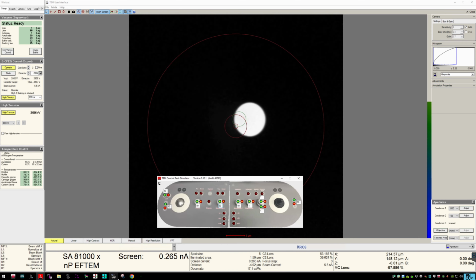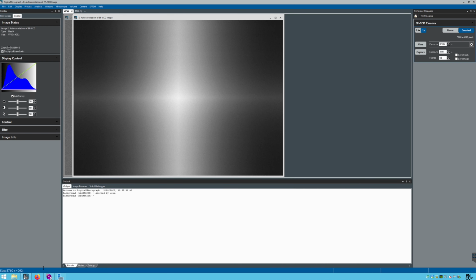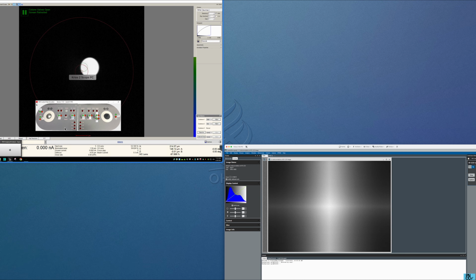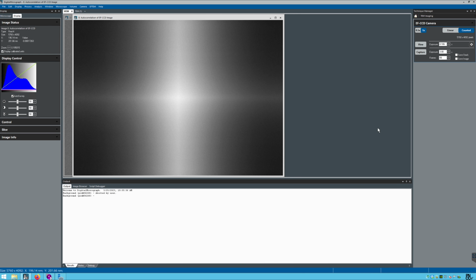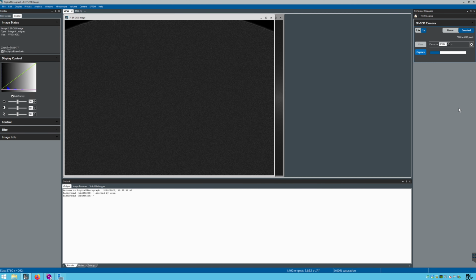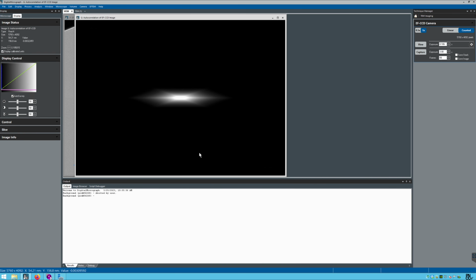I will now go back to SerialEM. Going to raise the screen. Now DM. I also need to change the spot size back. Did I do that? Nope. So let me lower the screen and spot down. Okay. Now I can raise the screen back to Digital Micrograph, and now I'm going to take again that 3-second exposure. Yep, I see the beam edge in view. And I'll go process, autocorrelation, and here's another example of a bad autocorrelation.